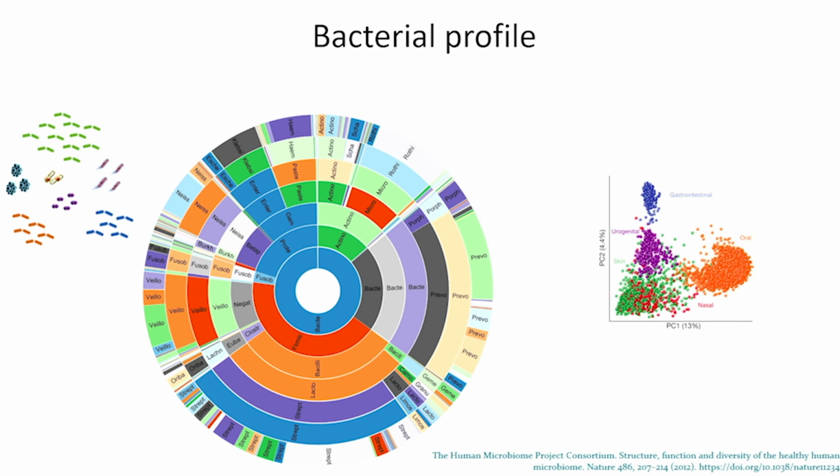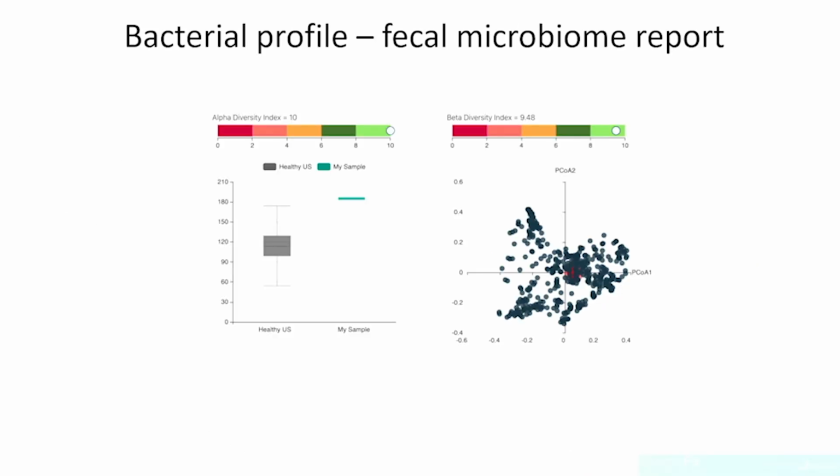So I'm not advertising any company, but I want to show a little bit of this report so you understand. The first page in the report for microbiome analysis on the clinical part, although we don't use that for diagnostic purpose, right? Just mostly for research, is showing how the microbiome looks in terms of diversity, in terms of profile.